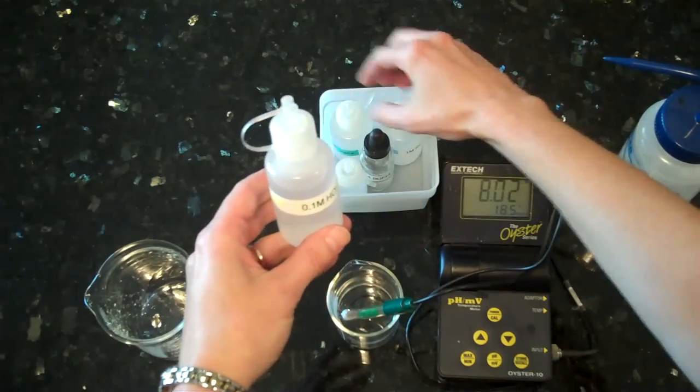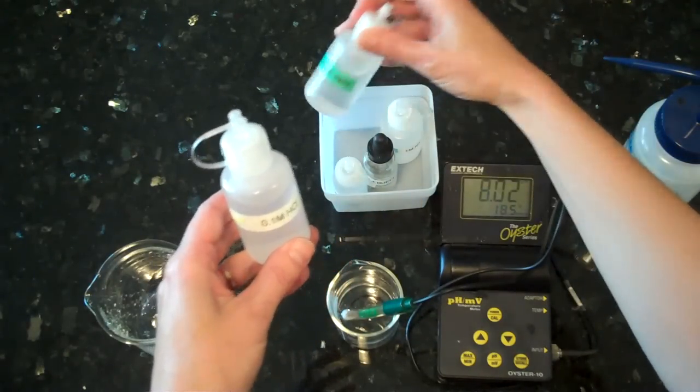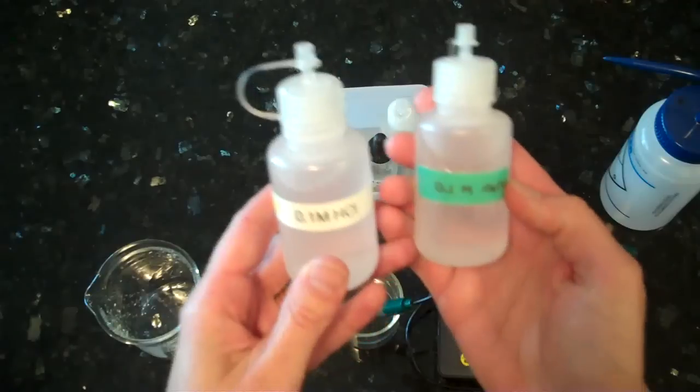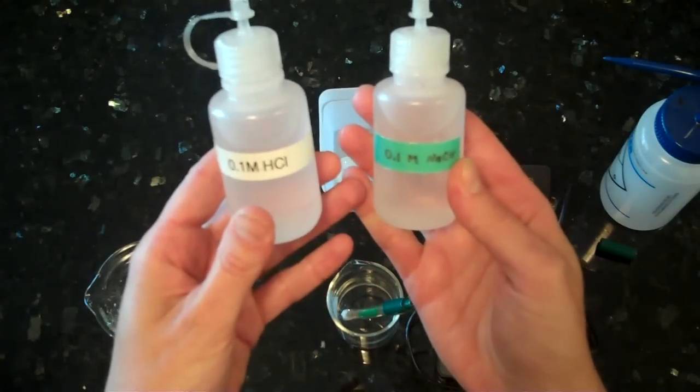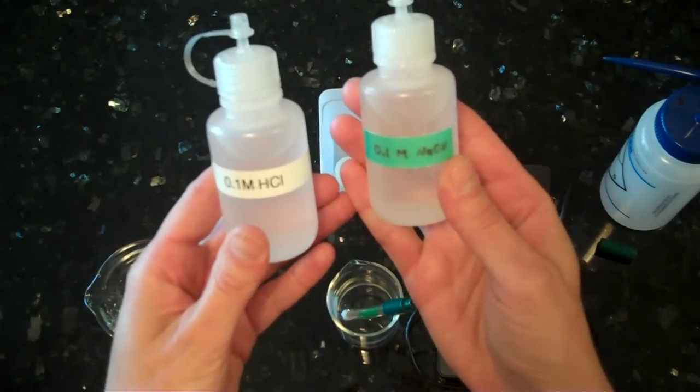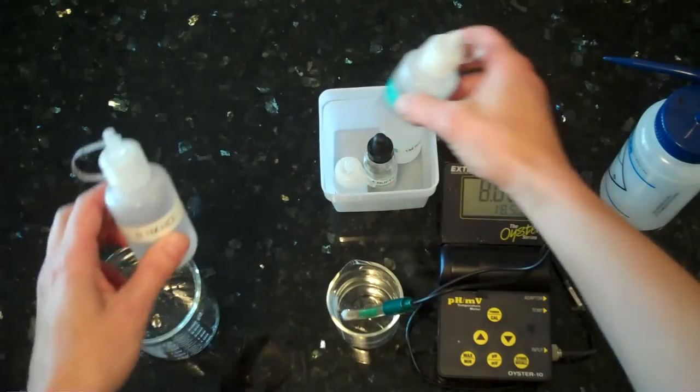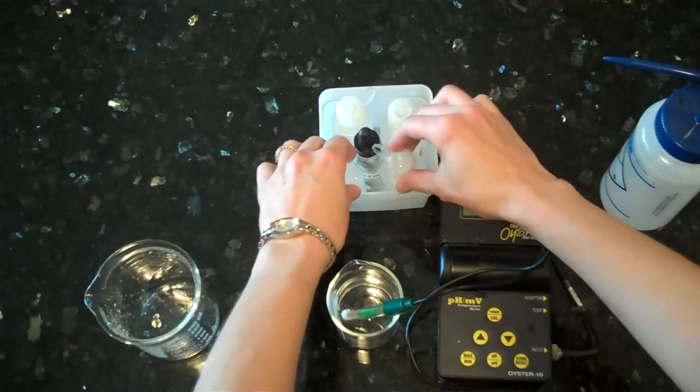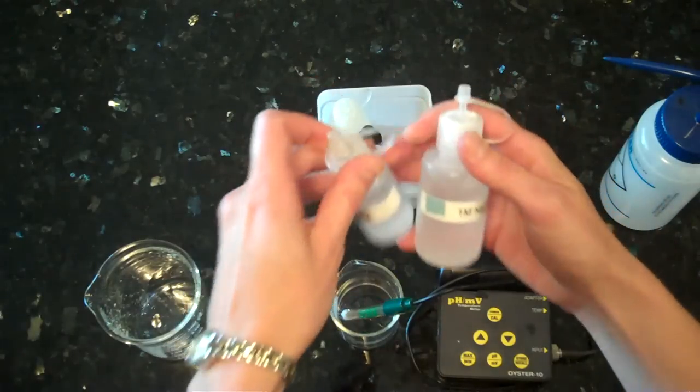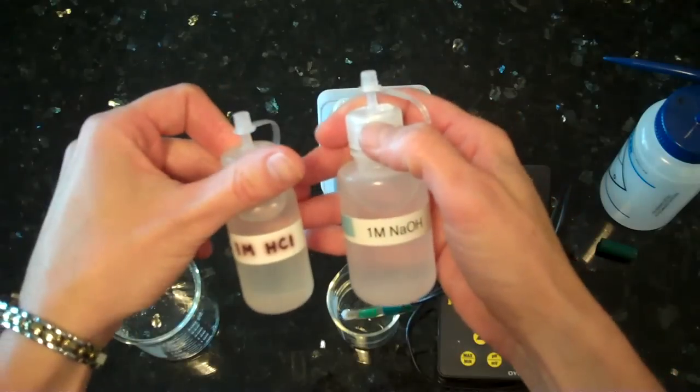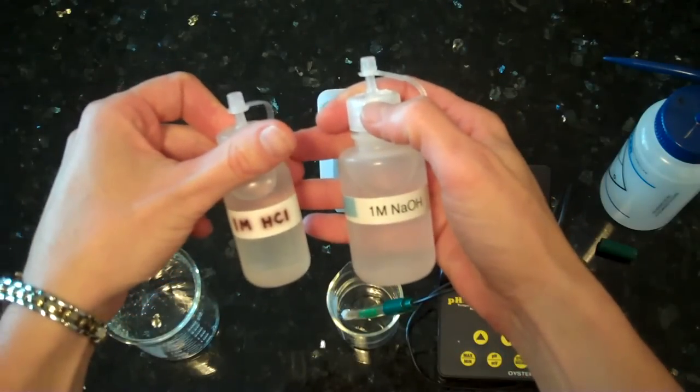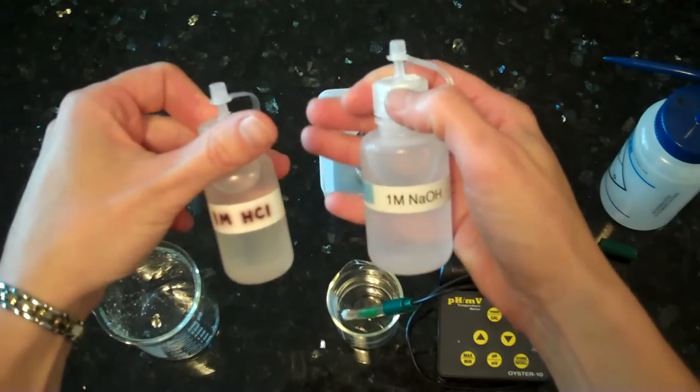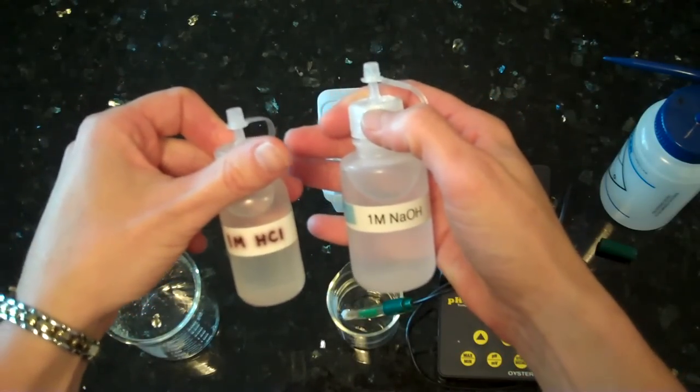I'm going to show you two concentrations. These are the lower concentrations of the acid and base: 0.1 molar HCl and 0.1 molar NaOH. If you want to do a more rapid change of the pH, the more concentrated forms are 1 molar HCl, which is the acid, and 1 molar NaOH, which is the base.